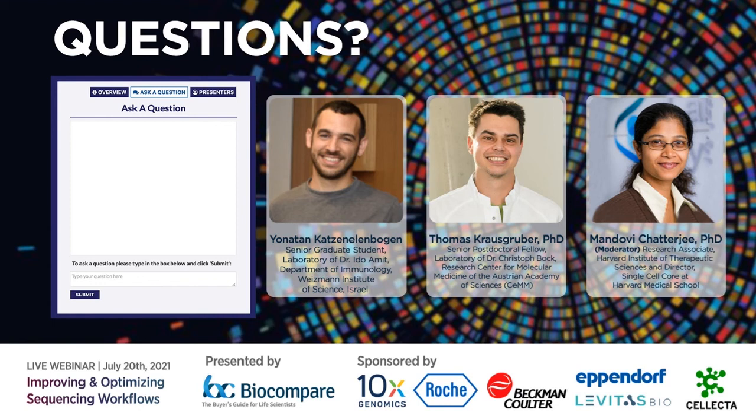Correct, I agree. But then while using a very stringent condition during FACS sorting, have you run into biasing your sample?